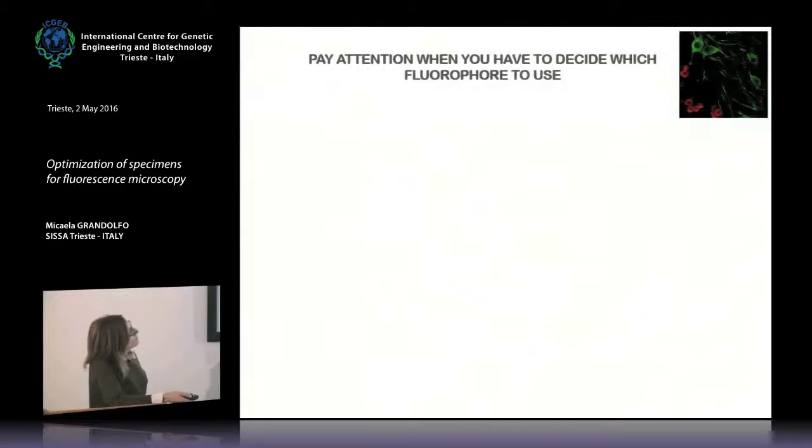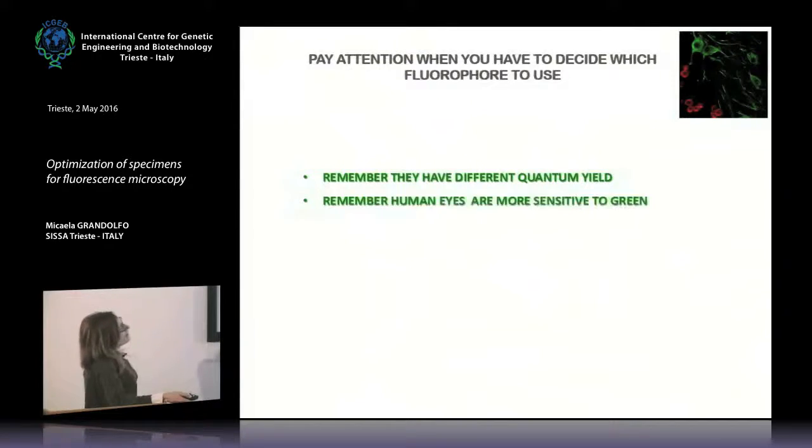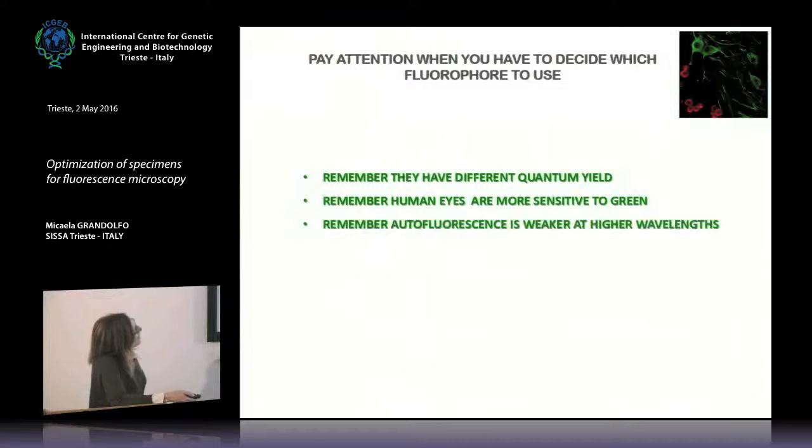Okay. So, when you have to decide which fluorophore to use, remember they have different quantum yields, different lifetimes, different photostability. Remember that human eyes are more sensitive to green, so if you want to show your result and obtain a very strong impact on your audience, use green, okay? No, it's true, it's not a joke.